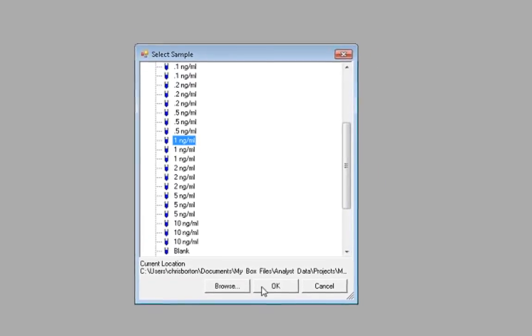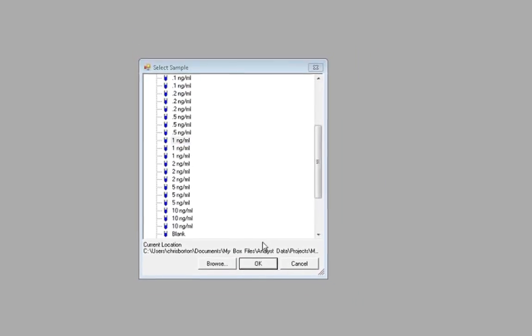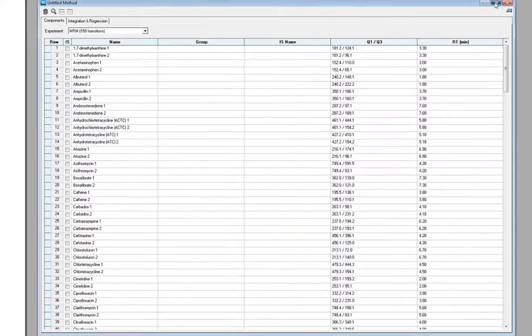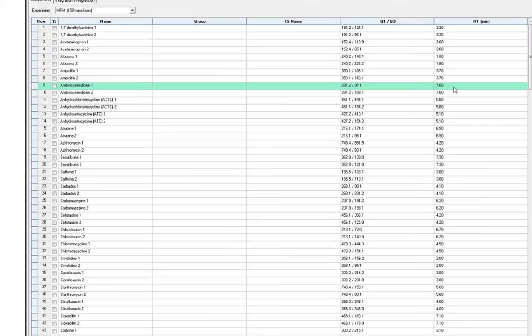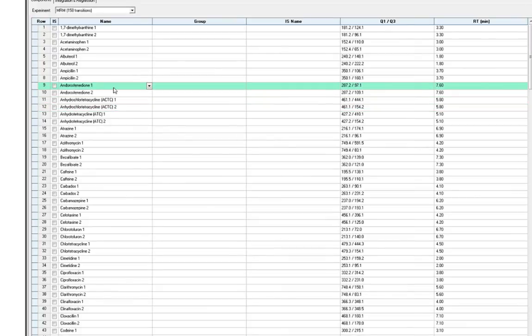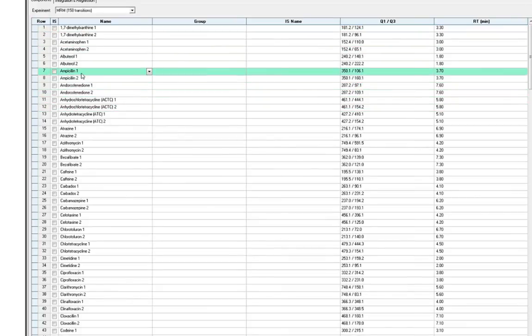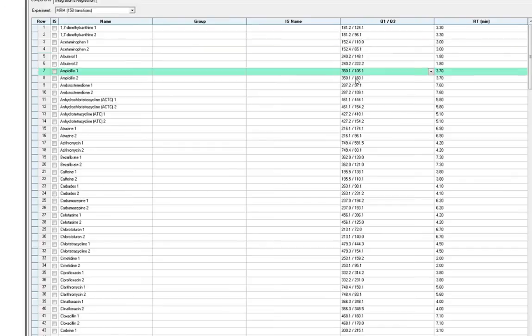MultiQuant will pull the information from the analyst acquisition method, including the names of each analyte, the MRM transition information, and the scheduled retention time.